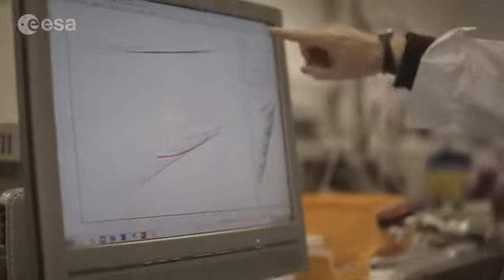Because I'm sure you've all encountered this, a rubber at low temperature gets much more brittle. At 100 degrees C, it's probably a little bit more flexible. And what the DMA really does is measure those effects. And then we use that in a technical interpretation, in this particular case for something called time temperature superposition, which is where we can move these effects on the time axis because we've modified the temperature axis, and we can look at acceleration effects and start making some predictions on how a material will respond in a longer duration compared to what our experiment is.